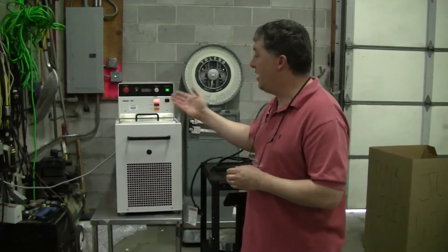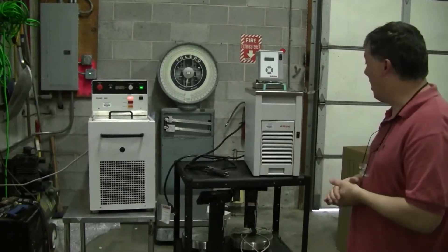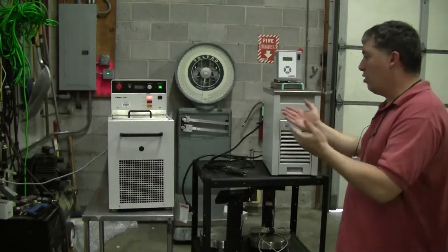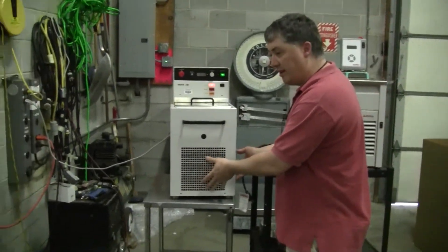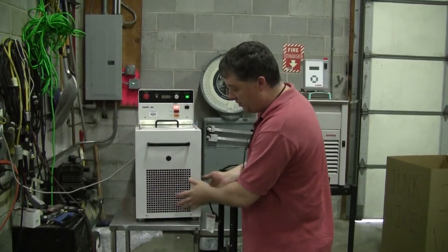This is an example — this is a Haake A81. We have standing right next to it a Julabo F25. Newer, older — what you'll note on most recirculating chillers is that the compressor is down in the bottom, which is indicated by the vent system here.